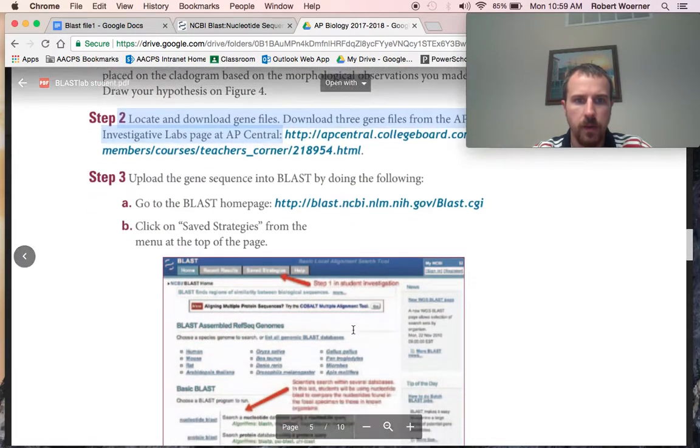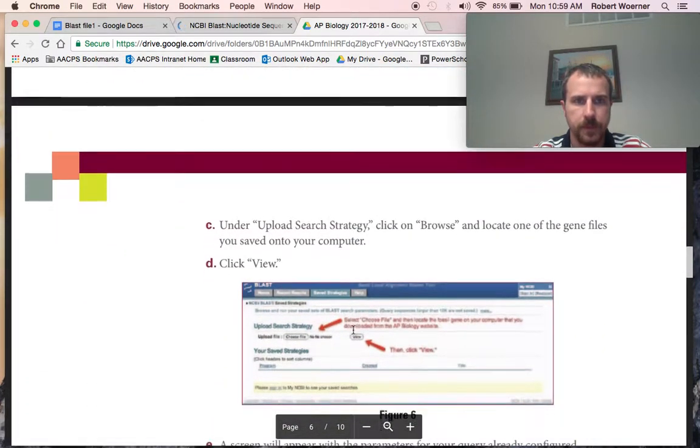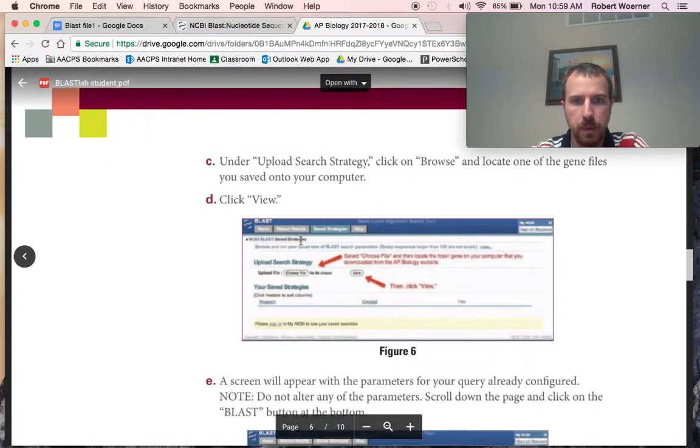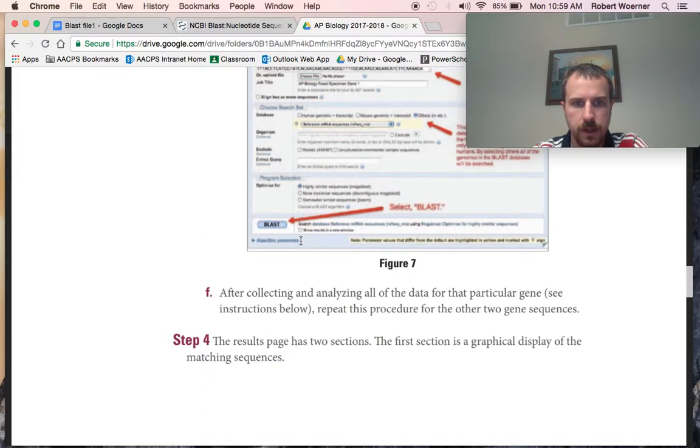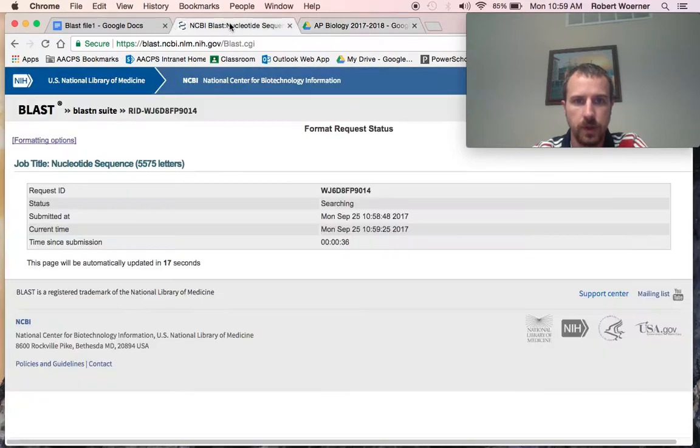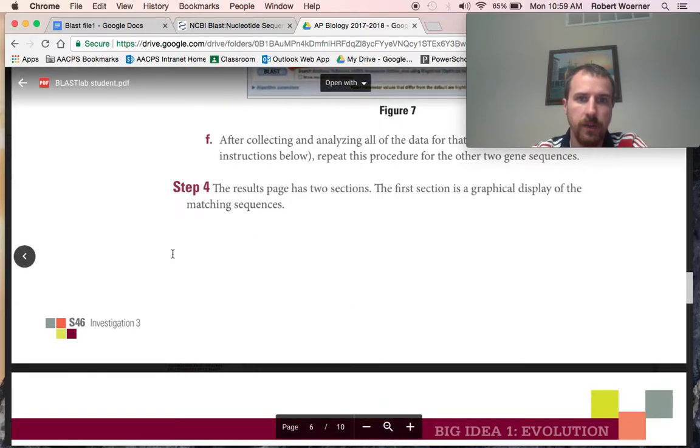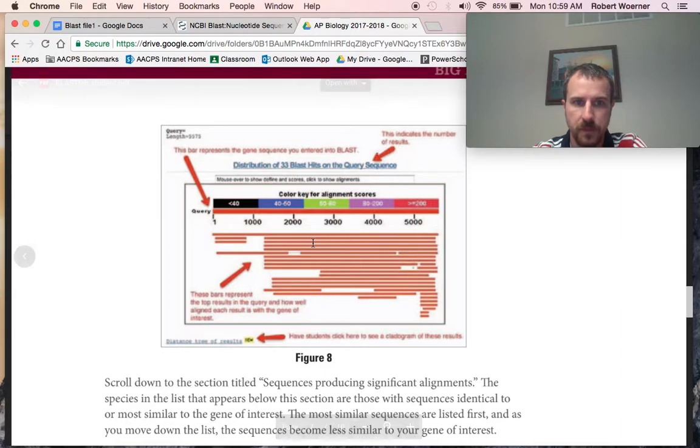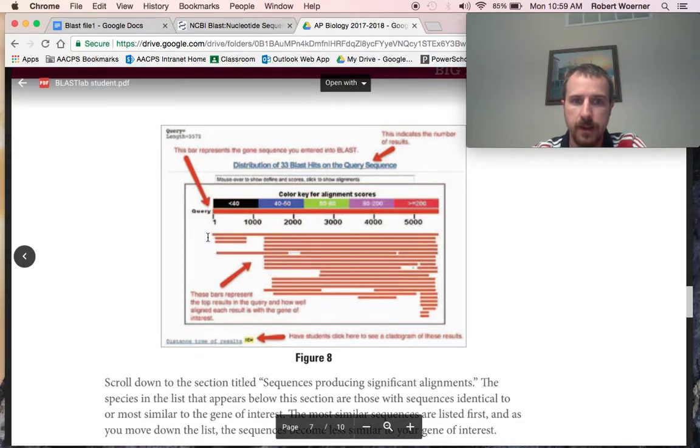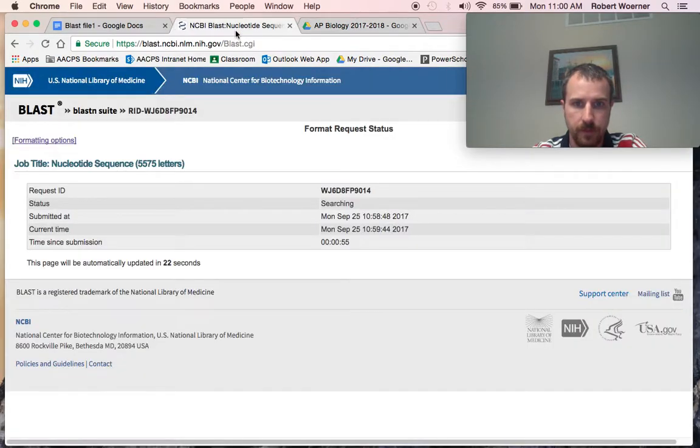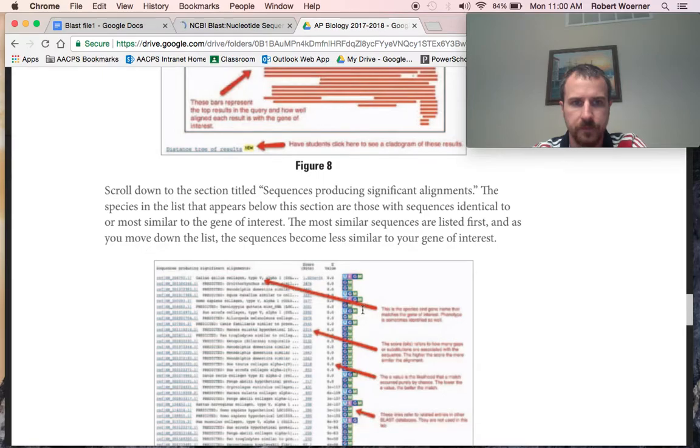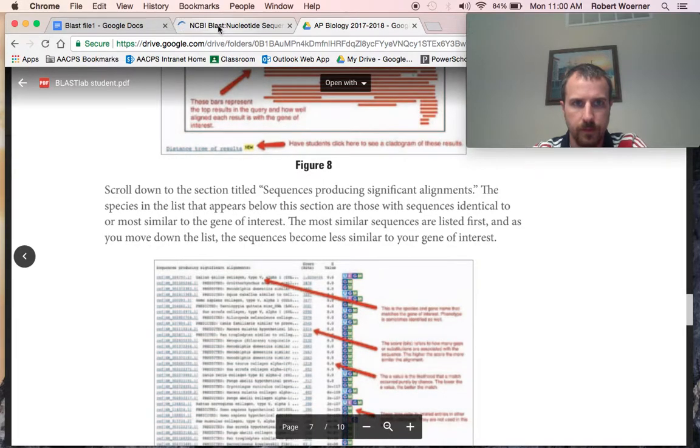After a while, you'll see that it starts calculating and it will determine which creatures have the most similar DNA to ours. So, we'll wait as that goes. Let's see if we can figure out what to do next as it's going. So, we've uploaded. We're viewing. This page is going to have two results on it. The first section is a graphical display. It's going to look like the red lines right there. Up here is where we put our data. So, this is our data. Every red line says that this creature has this data similar.